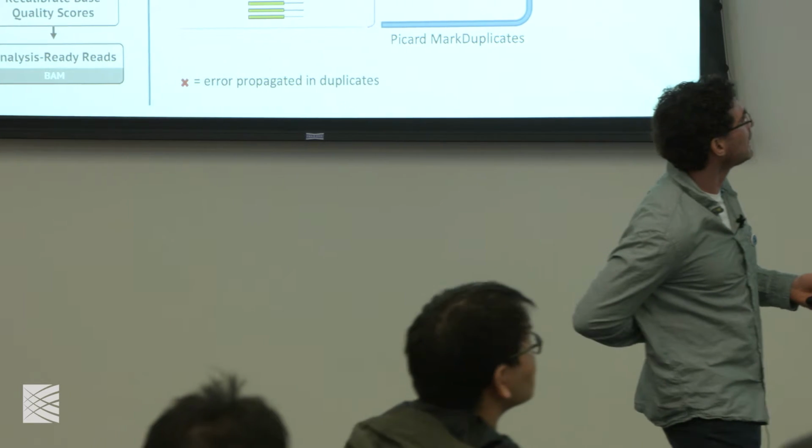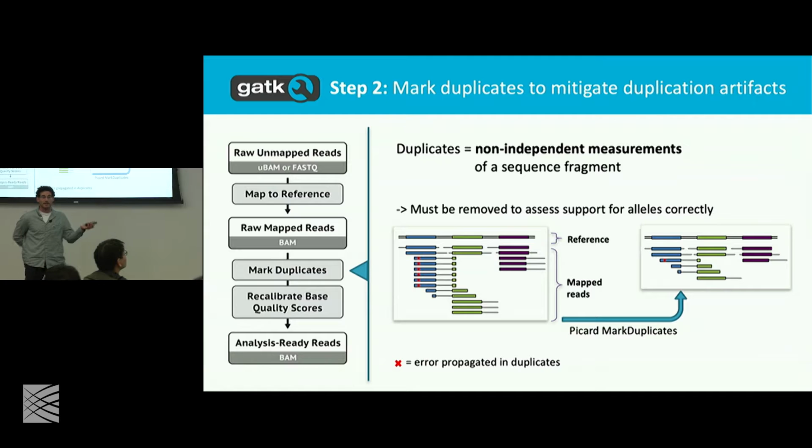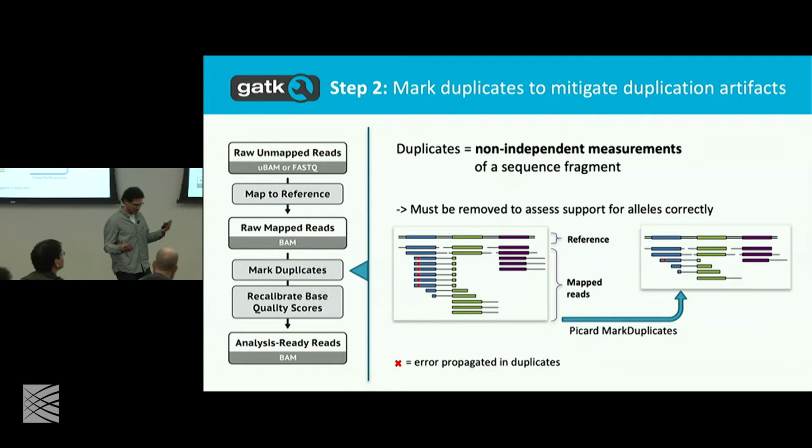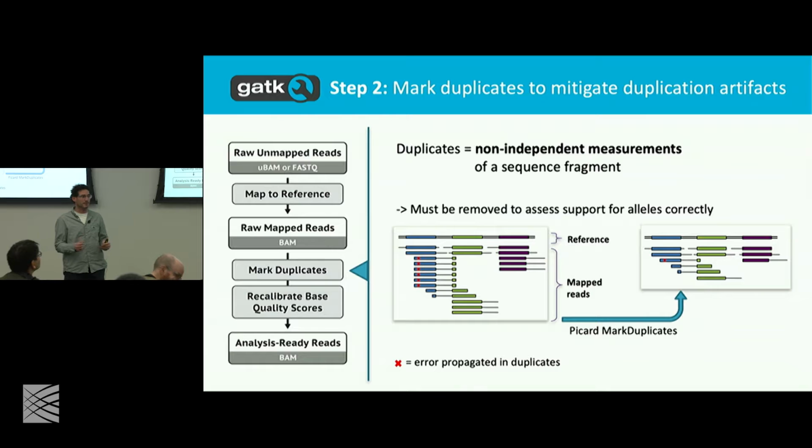All right. So going to step 2, so we have an alignment. Now we look at duplication. Duplication is a problem because in variant calling, we will count the same possible artifact multiple times if we have duplicates, right? So you could think of maybe there's a PCR artifact, and then it got read multiple times, and now it looks like you have 5 copies of the same artifact, and if you're a somatic caller or a germline caller, you might make a mistake.